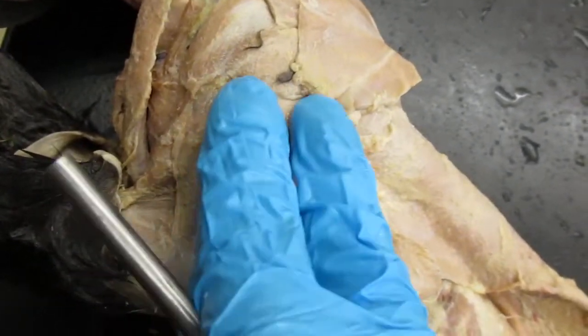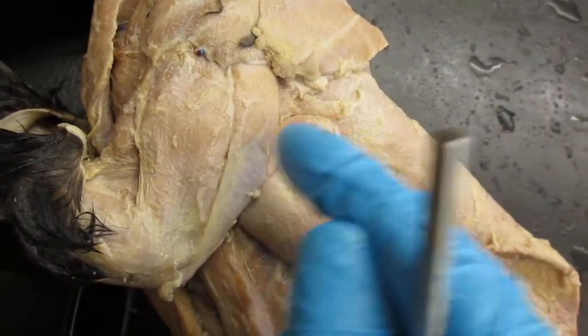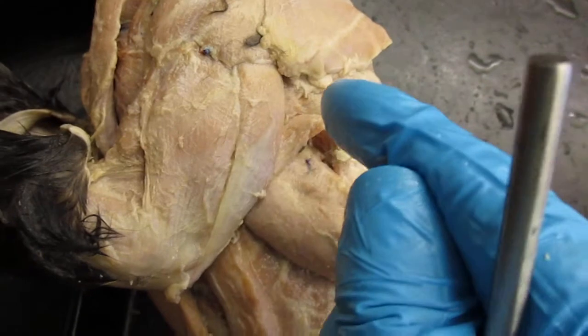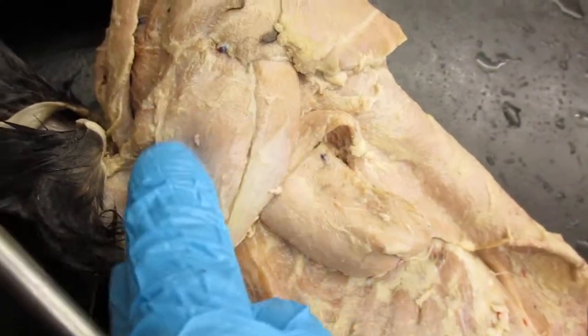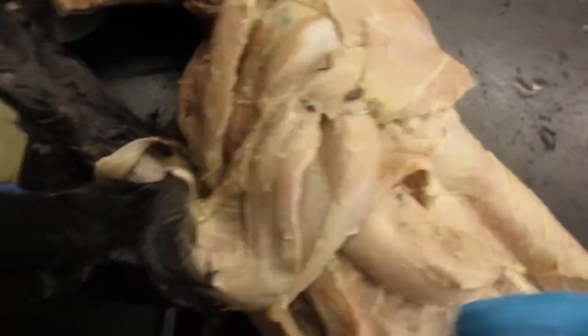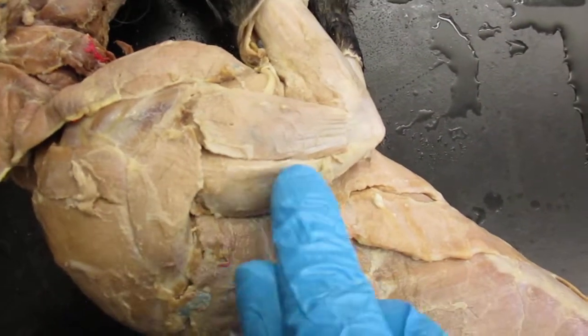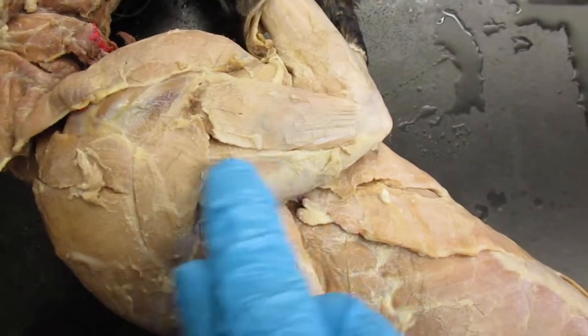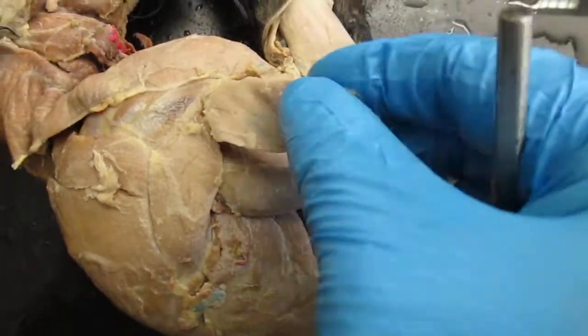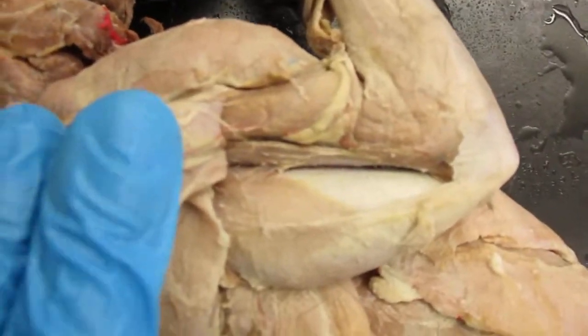Okay, I want to show you the next thing here, which would be the triceps muscles. So here you see the triceps muscles. This is the triceps brachii long head, lateral head, and underneath, which I haven't cut, would be the medial head. So let me flip it over and show you over here. So right here we see the triceps brachii long head, lateral head, and medial head will be right here.